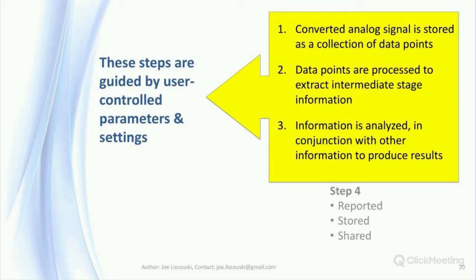These steps are guided by user-controlled parameters and settings. The data systems will come from the vendor with supplied default settings, but those are just a starting point for the analyst to adjust as needed. We can't simply assume that those settings are appropriate for all work. They need to be evaluated and modified to meet your requirements.